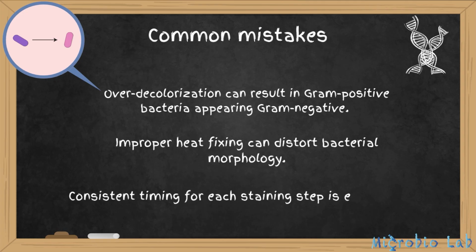Consistent timing for each staining step is essential for accurate results. Set a timer to ensure each stain is applied for the correct duration.